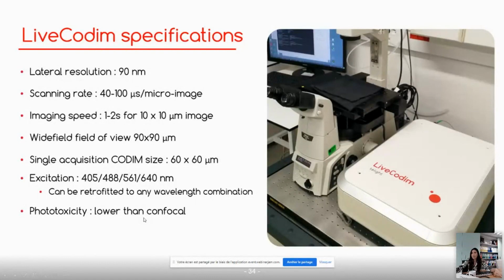The studies that were done to look at phototoxicity, this system uses really, really low light power. We rely on a linear fluorescence response in the sample itself, and we don't need a lot of light. So incident power on the sample, super small. So phototoxicity, there's almost none. It's like in the single microjoules of energy on the sample.